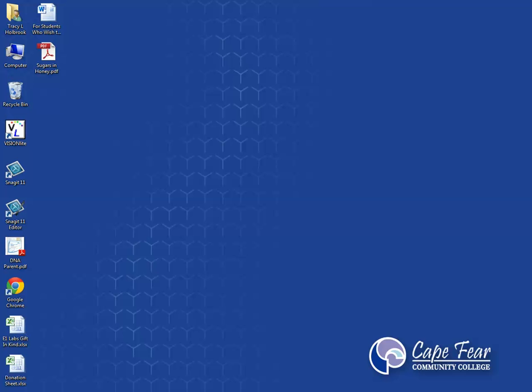So now you know a little bit about the instrument theory-wise. Now you know a little bit about the software screen, and now we've got to talk about what to do with the data and maybe some of the pieces and parts on the equipment as well. So stay tuned. There's still more to come.